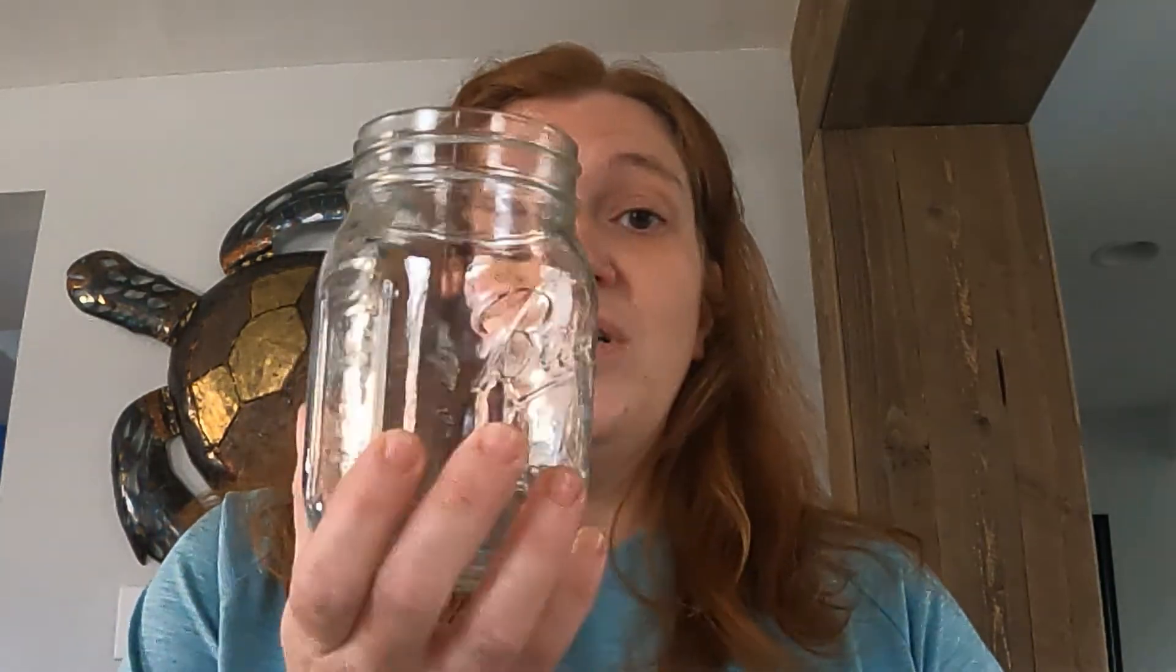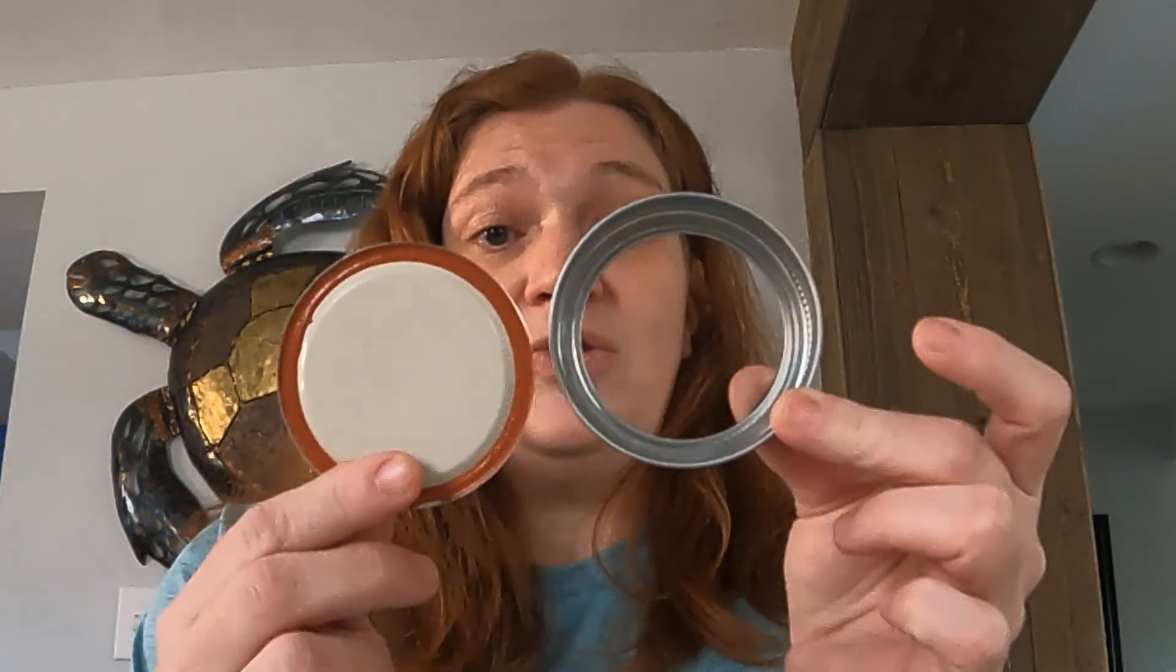Next let's discuss containers. I like to reuse glass jars such as spice jars. If you have access to baby food jars, those are a wonderful size as well. Mason jars are also a good option. The thing that you have to be conscious of when choosing a jar is what type of lid it has. It has to have a screw top lid and it cannot be the two piece ring system. You can purchase one piece plastic replacement lids online.